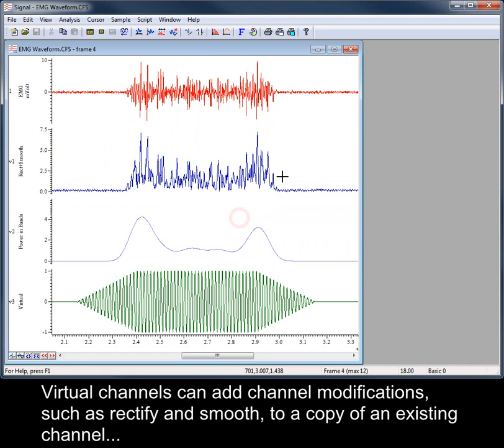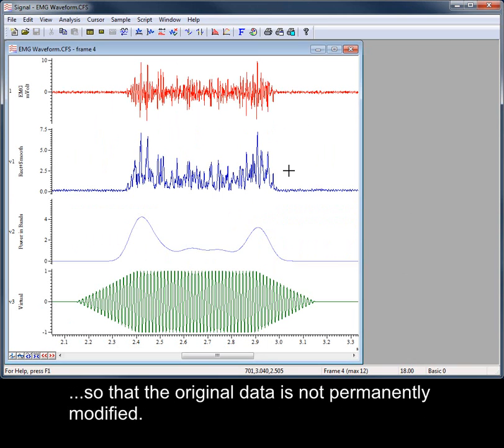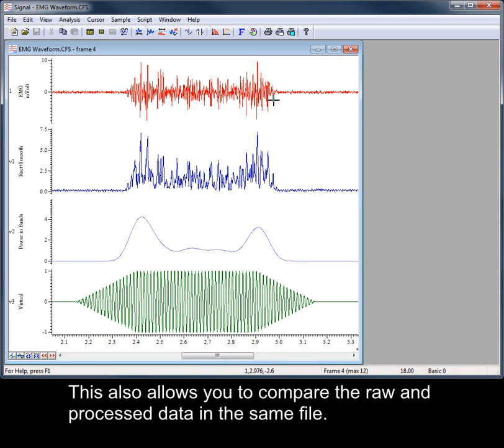Virtual channels can add channel modifications such as rectify and smooth to a copy of an existing channel, so that the original data is not permanently modified. This also allows you to compare the raw and processed data in the same file.